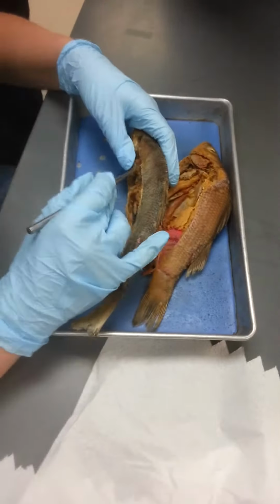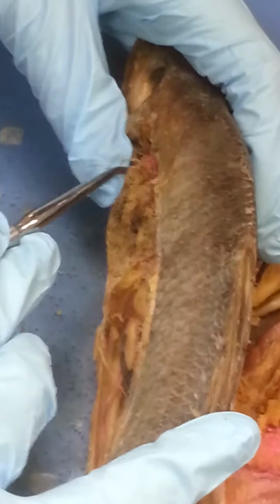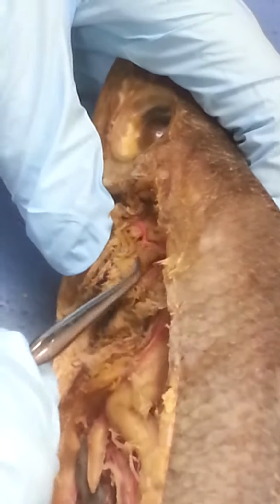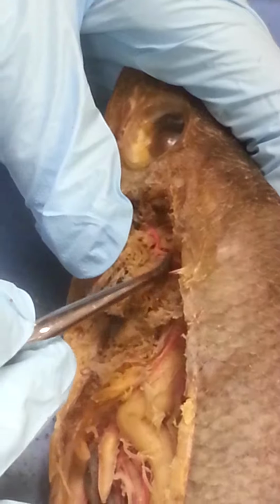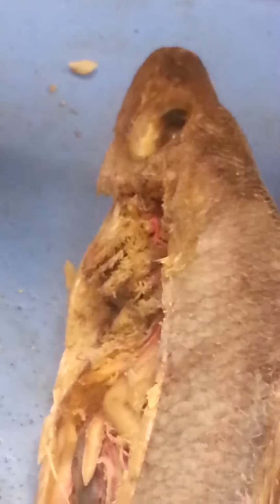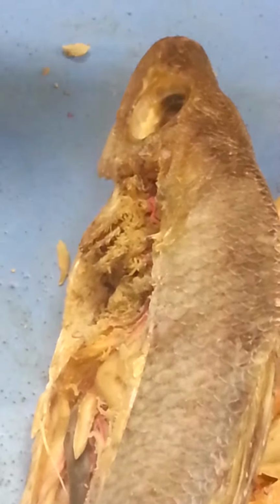Alright, and then you have, these are the efferent branchial arteries. This one, and then you have 2, and then 3 and 4. So you can use 2, 3, 4. Then the one that kind of connects all of it, this big one right here, is the left root of the dorsal aorta. So remember, that's left and right based off of the organism itself, not your perspective. Okay, so left side, right side.